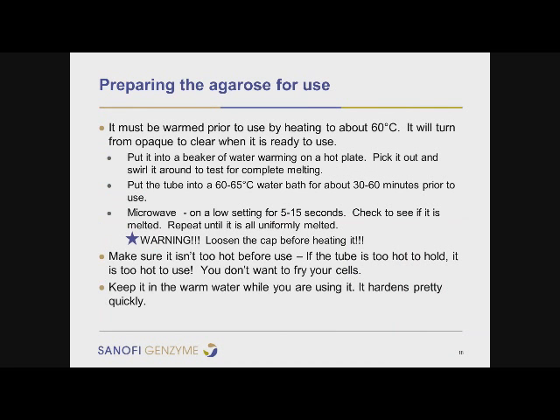So, preparing the agarose for use and the actual embedding. The day that I'm going to do it, I'm going to need to warm up my agarose prior to use. And I need to get it to about 60 degrees. I can tell it's at the right temperature when it turns clear again. That's how I know it's ready for use. There's a couple different ways to do it.